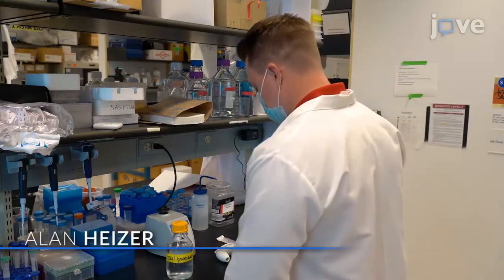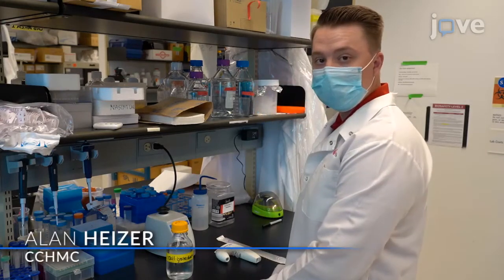Some parts of the protocol will be demonstrated by Alan Heiser, a research assistant of my laboratory.